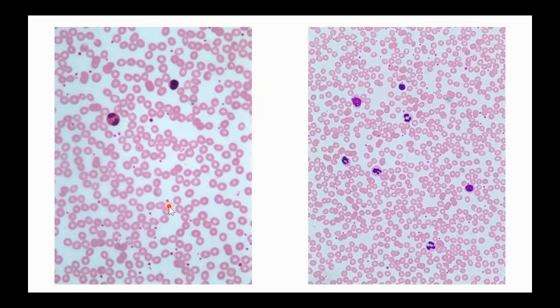Platelets are super small. These are the things that help your blood to clot. So platelets are these little tiny things that I see floating around next to those red blood cells. So, three kinds of cells in blood: erythrocytes, the red blood cells; the white blood cells that aren't actually white but are kind of purple, blue, whatever, the leukocytes; and then those tiny platelets. Yeah, you're totally fine, Kira. They're very small, hard to see, so you're totally cool.